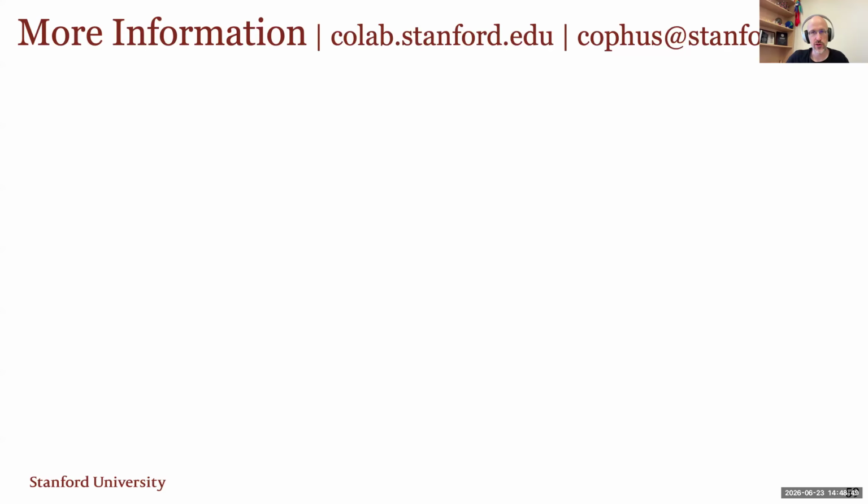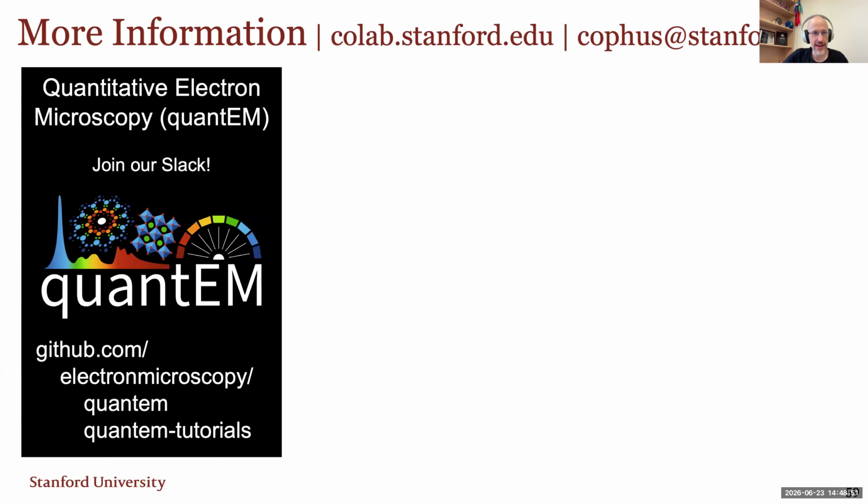Okay, so I will summarize my talk by saying everything that you're seeing there so far has been put into our QuantEM software package. This stands for Quantitative Electron Microscopy. This is meant to be a community effort for machine learning inverse codes and analysis codes for electron microscopy. And it is not meant to be limited to diffraction and 4D STEM. We're also doing spectroscopy. We're also doing 3D tomography and many different kinds of imaging in 2D and 3D.